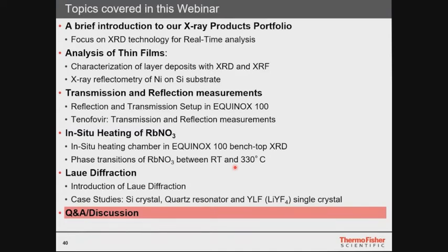And so you can also use monochromators or mirrors. Monochromators use diffraction because the diffraction angle of each energy is different. So you can, for example, separate K-alpha 1 and K-alpha 2 and K-beta by using a germanium monochromator, and you can even focus the radiation to get more intensity. Then you get very brilliant radiation, which only consists of one energy and only one set of signals. But you sacrifice some intensity.